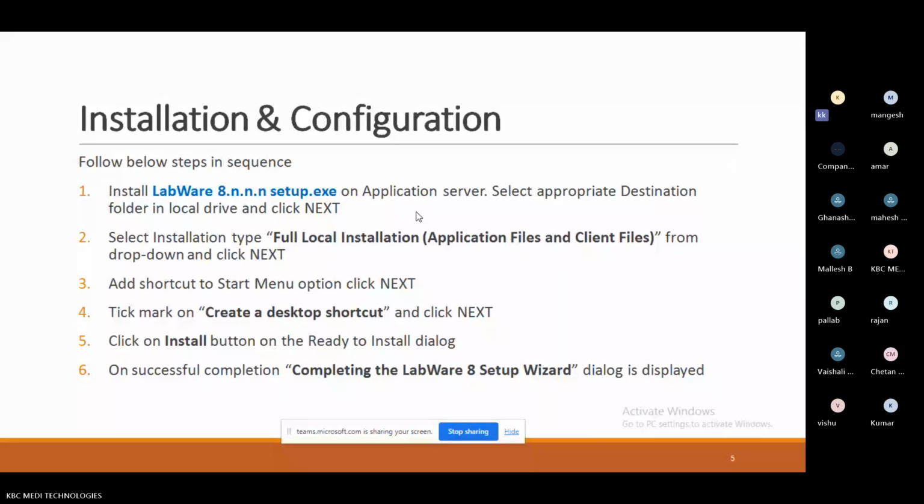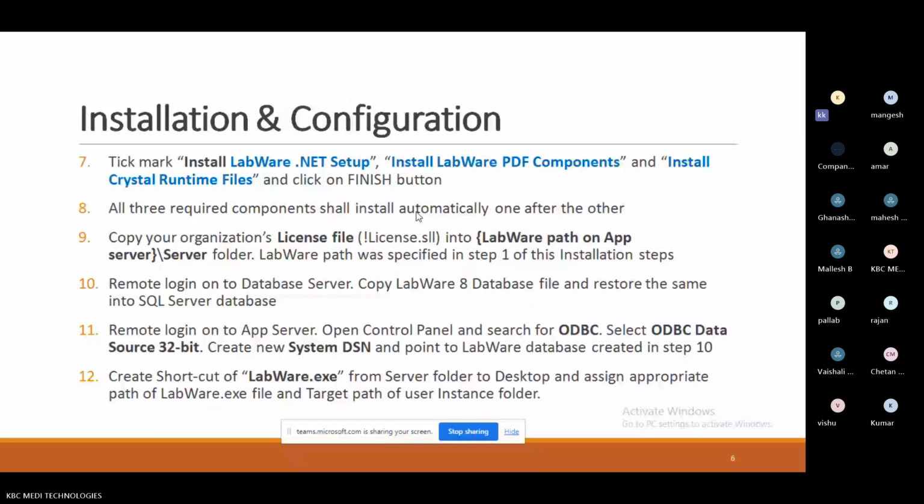Once you finish the installation, you need to follow the respective procedures. That means after installation, how to launch the application, from where it should launch, that complete information we need to update, usually under properties, in any application. In the same way, it is applicable to the LIMS application also. And here I have mentioned some of the basic information.